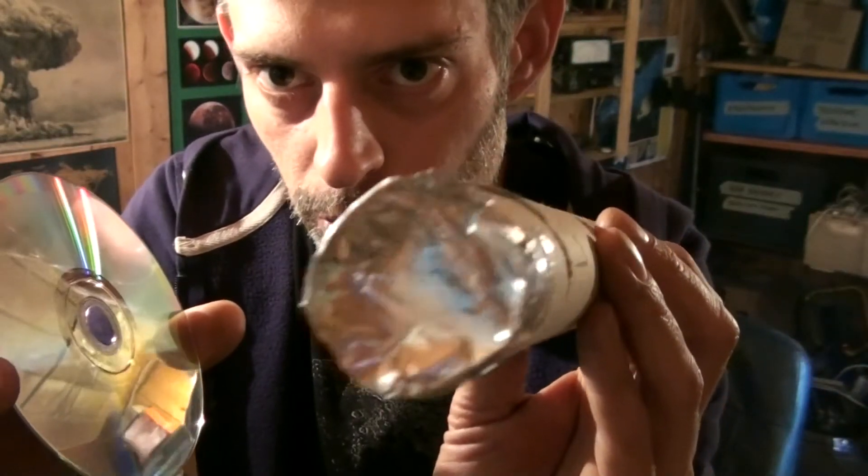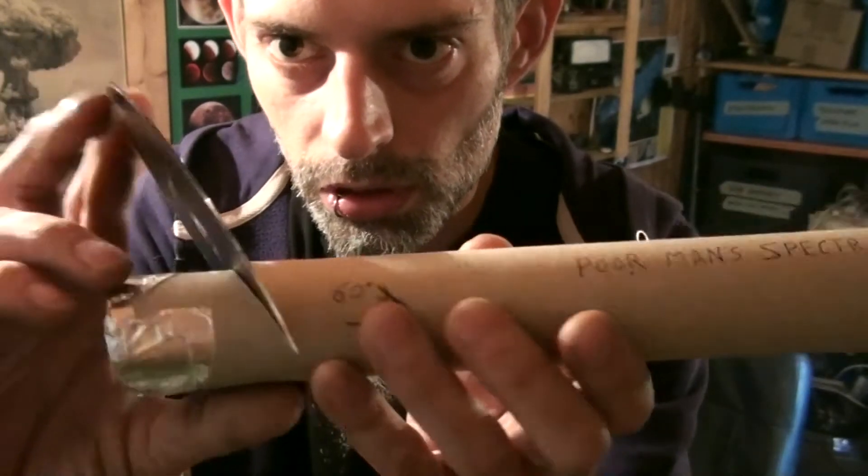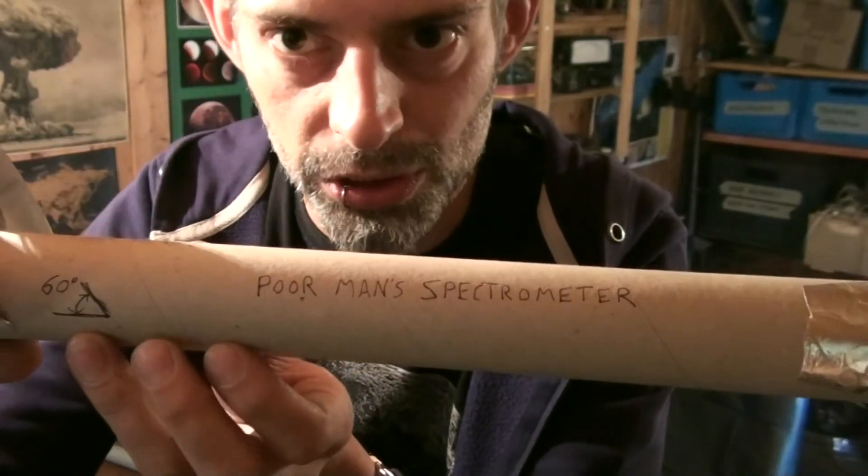Also, tape the back ends closed. Then you shove the CD inside and you can look into the viewing hole. There you go.